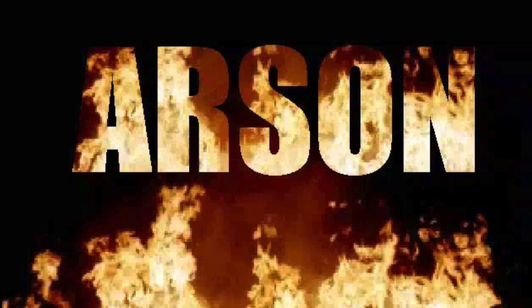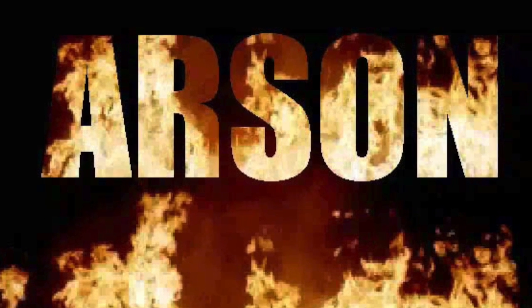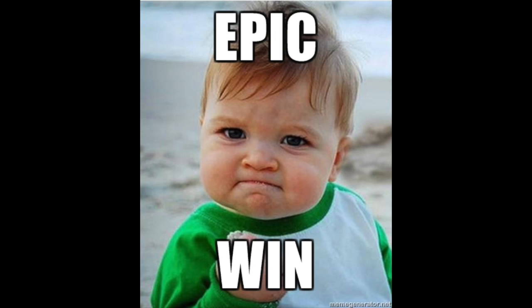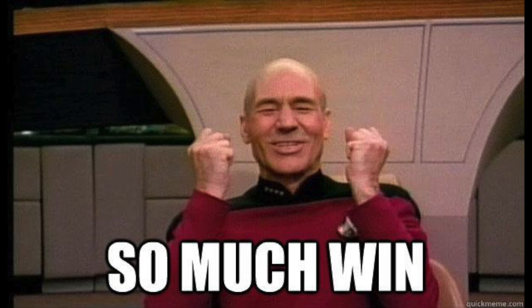And to wrap this up, here's our conclusion. Arson is the action of provoking fire, and we wanted to find out which of these substances could provoke fire. We came to the conclusion that since turpentine was the one that was most flammable, then turpentine is the most probable to cause arson.